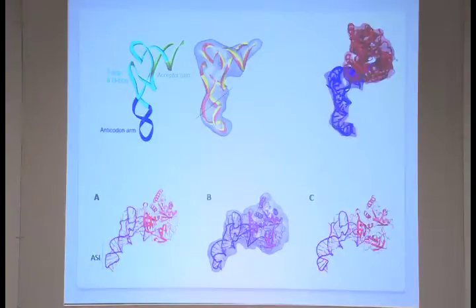But with this fitting, at least it could be explained that a major change in the conformation occurs. So there is a limitation in the cryo-EM structure, but with this combination of fitting methods, you really can predict. Of course, that has some limitations also, but still you can predict beyond what we can see in the map. So if you get a lower resolution map, you can try these flexible fitting methods.